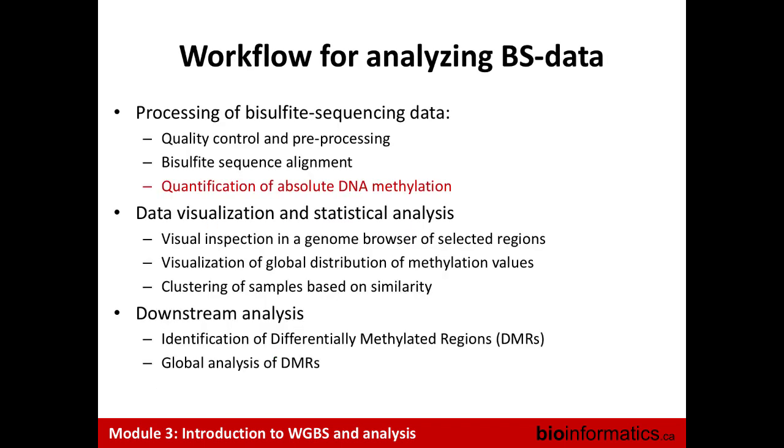Okay, so moving on. We've talked about alignment, which I mentioned was one of the big challenges. But once we've aligned the reads, then we're going to be interested in quantifying the levels of methylation.